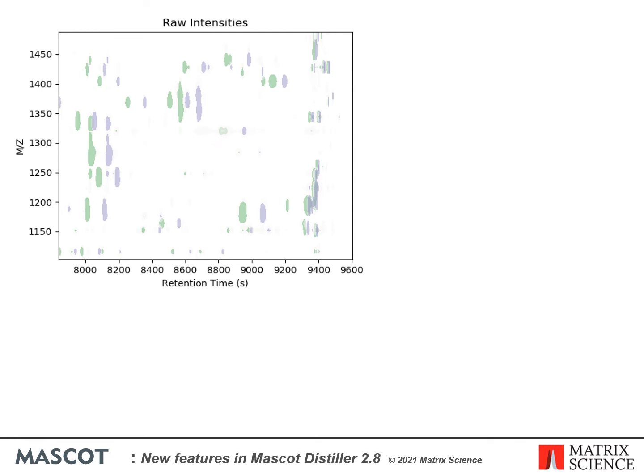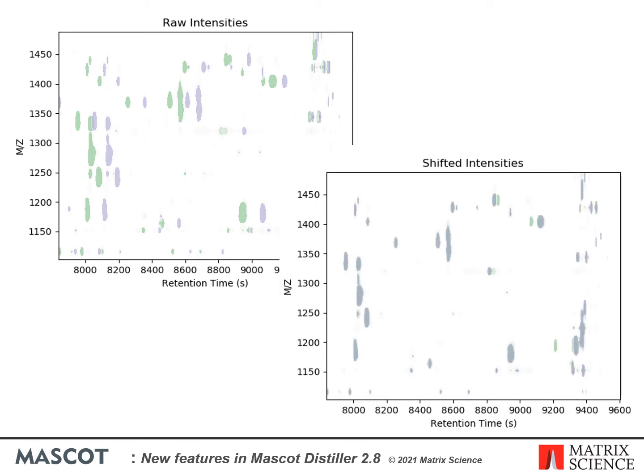There is a separate presentation looking at this in more detail, but to show the effect of the alignment: here we have MS1 features from two files in a label-free project plotted with retention time on the x-axis and m/z on the y-axis. Before alignment we can see a clear shift in feature retention times between the two files. After alignment the common features between the two files are now clearly overlapping. Note that this plot was created outside of Distiller for illustration and is not currently available as a report.